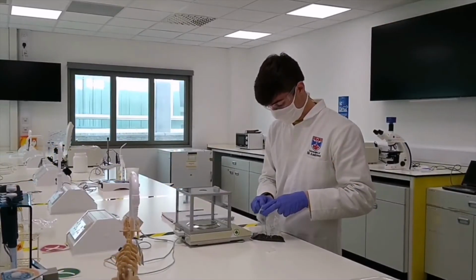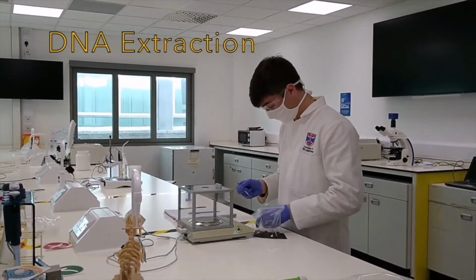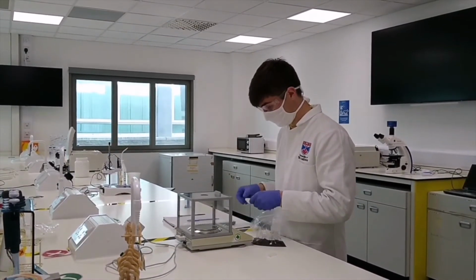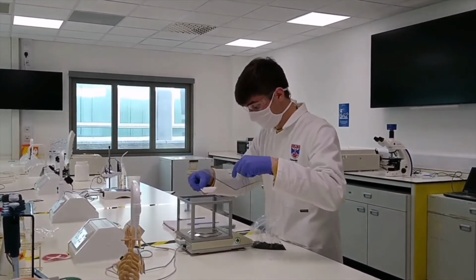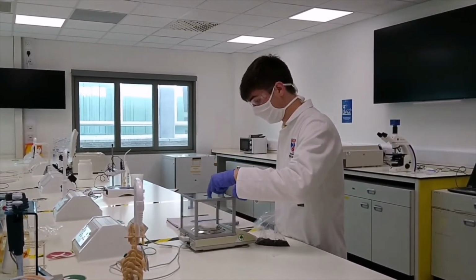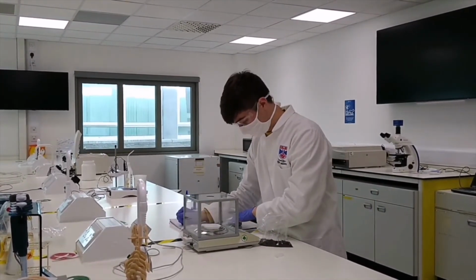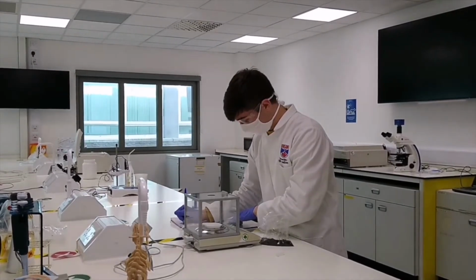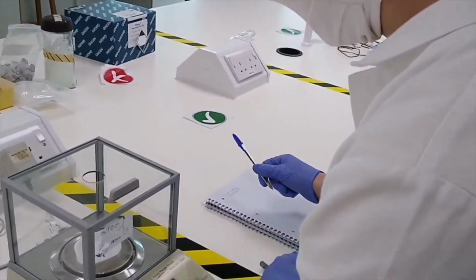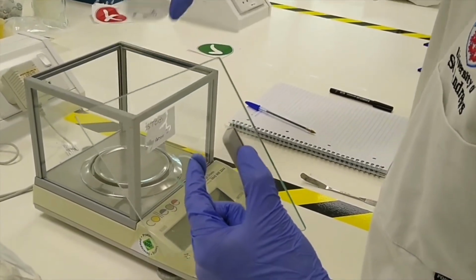But now we have our soil, and the backup just in case, we need to extract the DNA from the soil we have. To do this, Adam will measure out some soil into a white dish called a weighing boat, and pop it into a balance. Like measuring flour, but far more accurate and not for making cake, unless that cake contains soil. Notice how he keeps everything recorded in a notebook for future reference. Once done, the dish can be placed to the side.